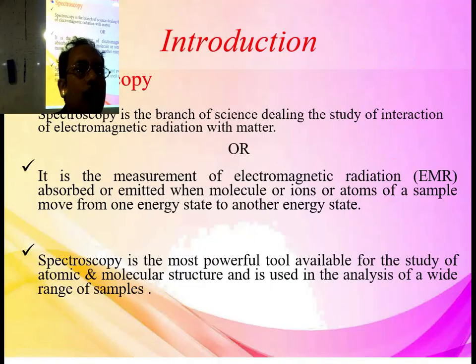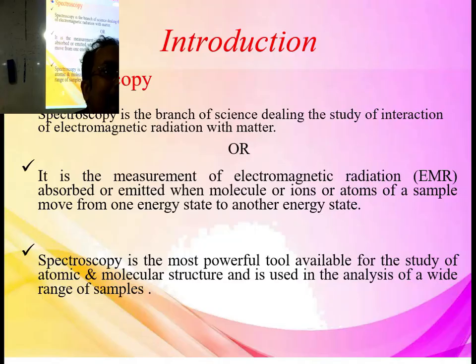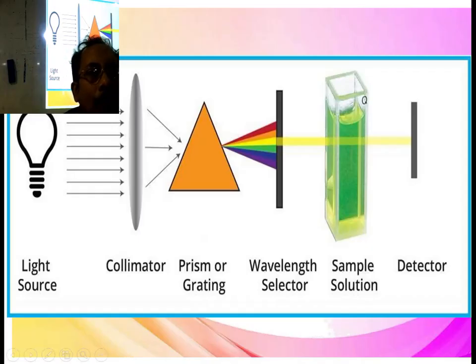Spectroscopy I have already introduced to you. What is spectroscopy? The matter-energy interaction. The interaction between matter and energy gives a sort of analytical diagram, and it is plotted by some plotter. We call it a spectrum. Now this is the overall plan of how you do spectroscopy.